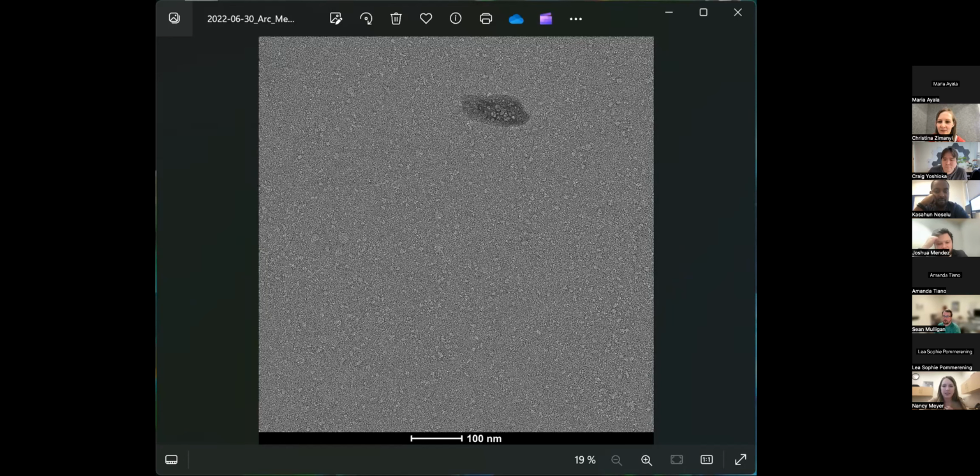Gotcha. We couldn't answer that, and we were discussing it among ourselves. It's user CryoGrid data, but it was taken on an instrument with a little lower resolution, I think, a 200 kV cryo instrument. So this could be overexposed in that amount you see here.